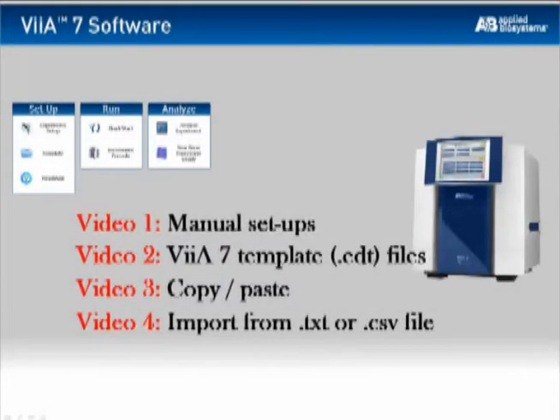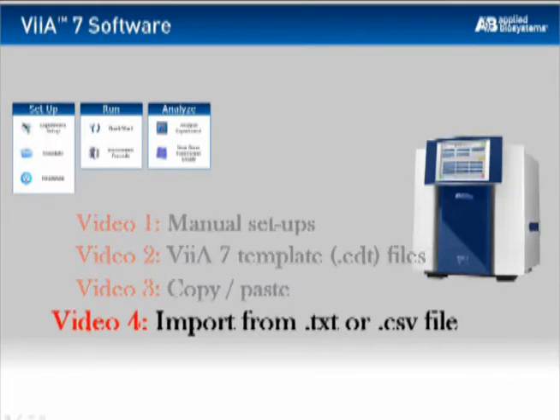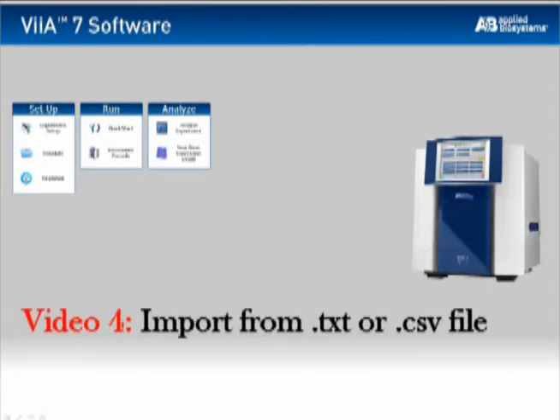Let's have a look at the fourth and final way to enter setup information into a new run file: importing text or CSV files.